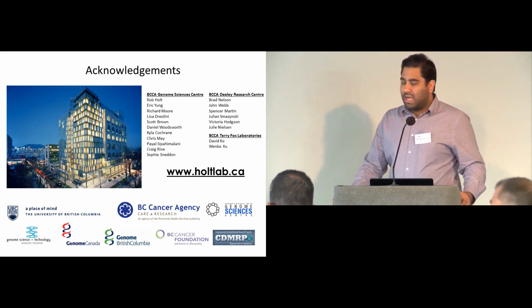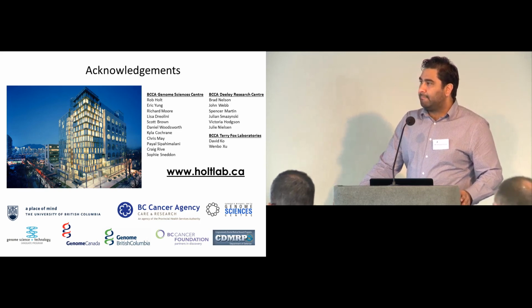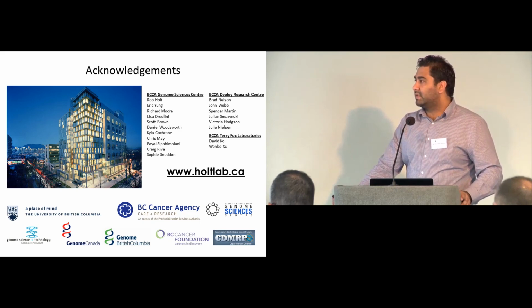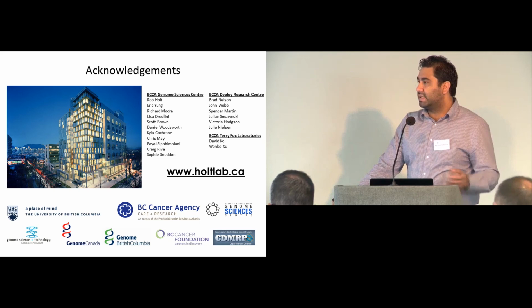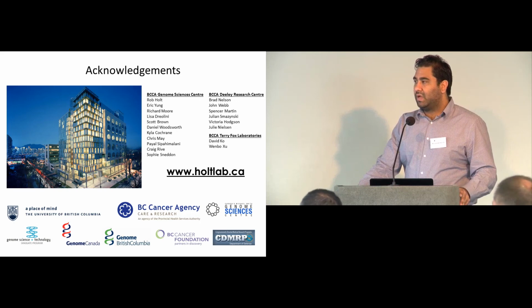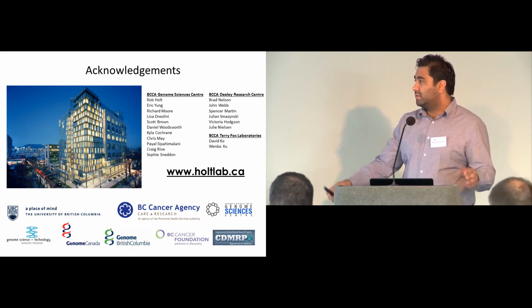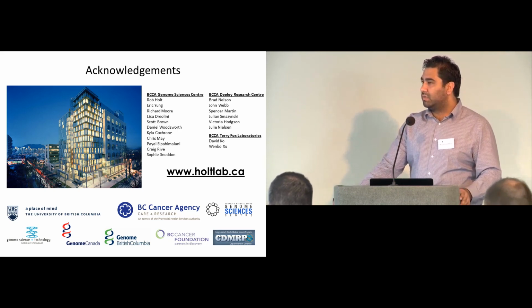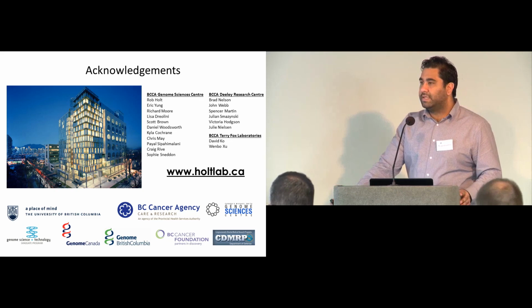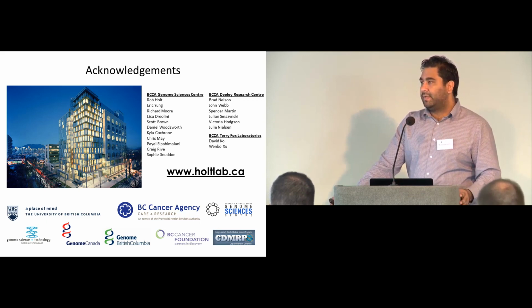I've done some work on those first two approaches, and we find, as I said, with the autologous B cells, which is the cell type we were working with, CD40L stimulated in vitro, that it's really hard to get them up to numbers in the hundreds of millions, which is probably what you want to be able to adequately screen more than 1 million different sequences. Moreover, they're quite difficult to transduce. We figured that was probably the best case cell type, and even that would be hard to scale to those levels.